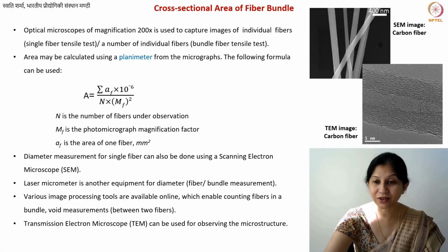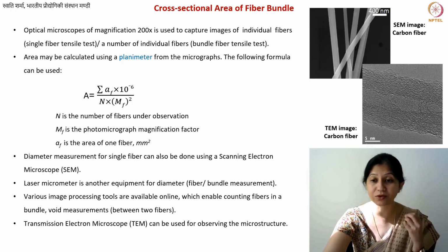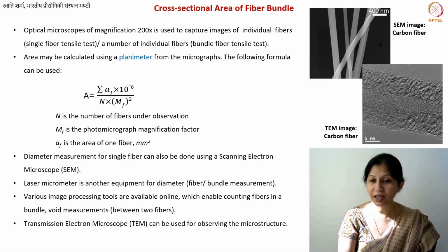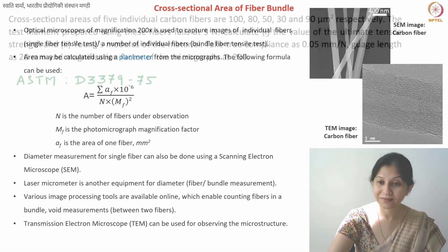Again, this depends on your very specific equipment and specific measurement technique, specific type of carbon fibers, whether you want to do it for single or for a bundle of fibers. You can accordingly choose your parameters, and you can accordingly choose your specimen as well.